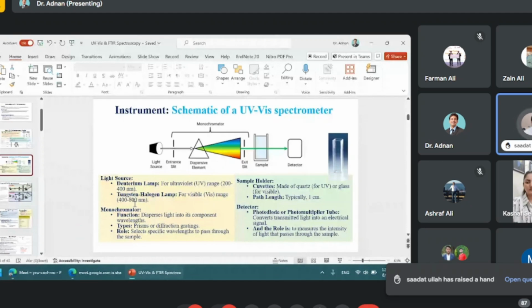So I want to determine this 20 ppm solution, which is unknown to me. Let's suppose I put this into the cuvette in the UV spectrophotometer and pass the radiation. When we pass this radiation, the absorbance will automatically be above 2, because for methylene blue, the absorbance for a 10 ppm solution is about 2.